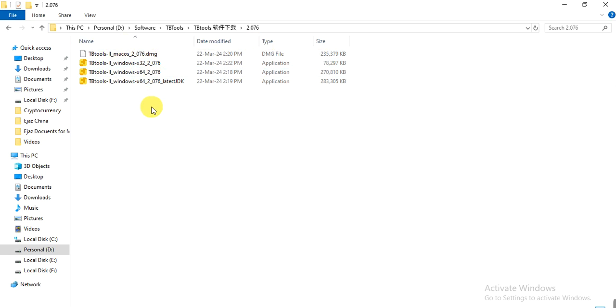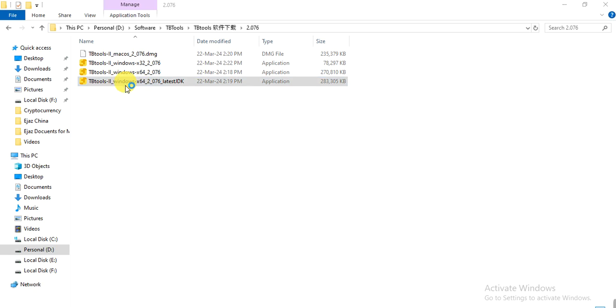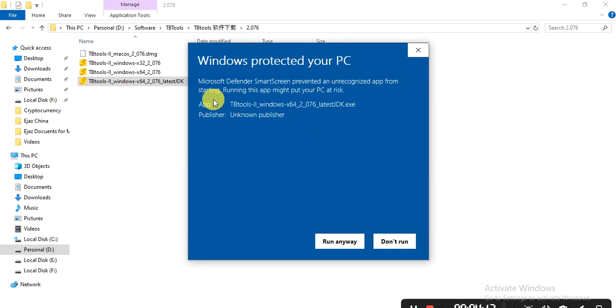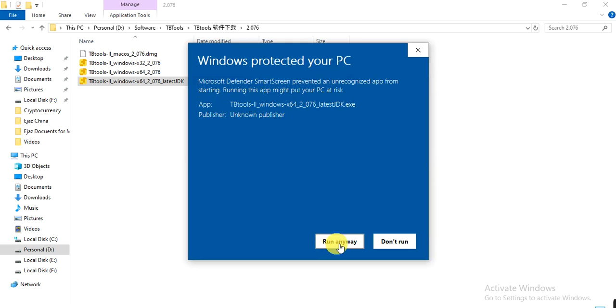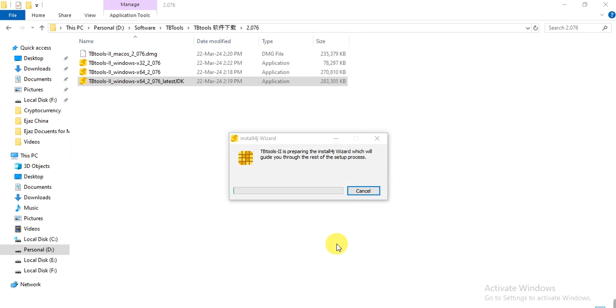Double-click on it. Here comes a security warning. I click on 'Run anyway' and then it starts installing.